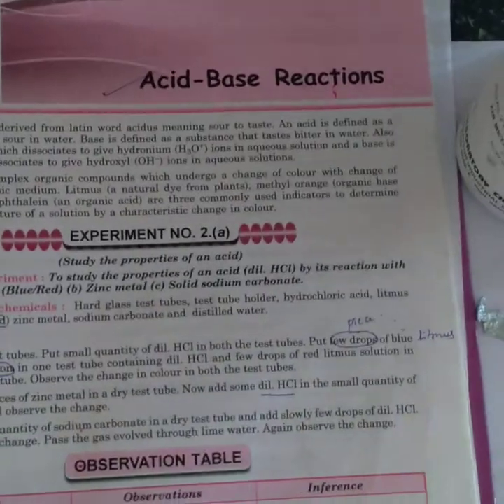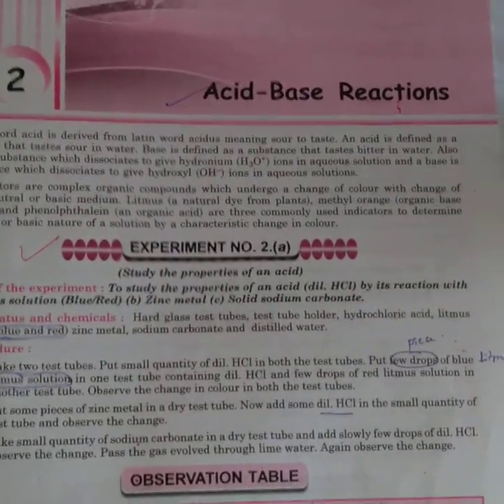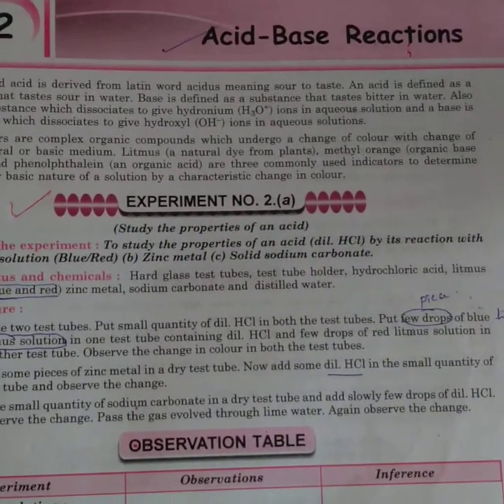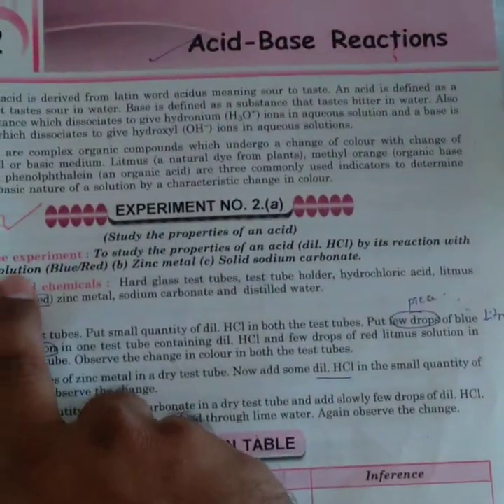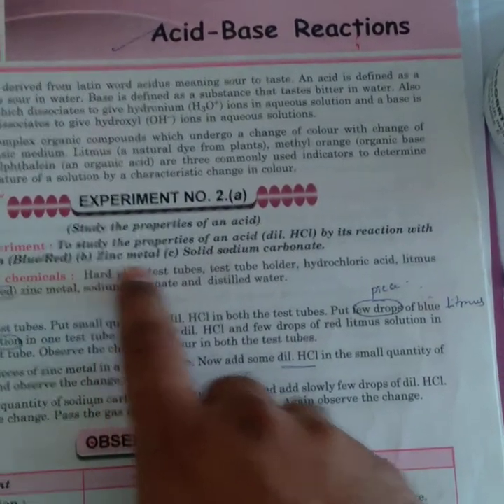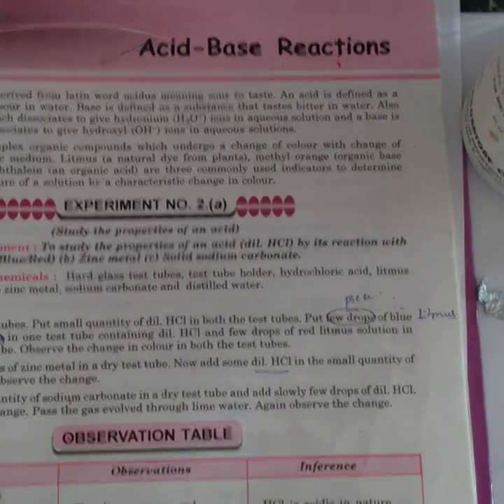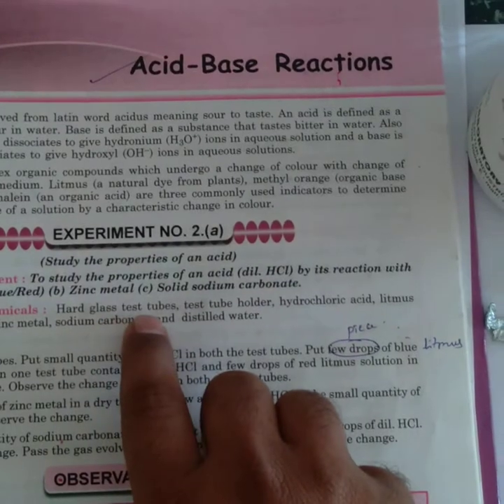So, the aim of the experiment: to study the properties of an acid, that is dilute HCl, by its reaction with blue and red litmus, the reaction with zinc metal, and the reaction with solid sodium carbonate. The apparatus we need in this experiment are hard glass test tubes.